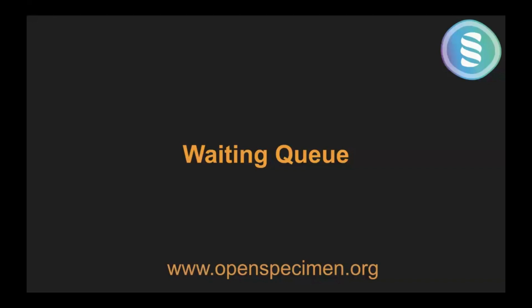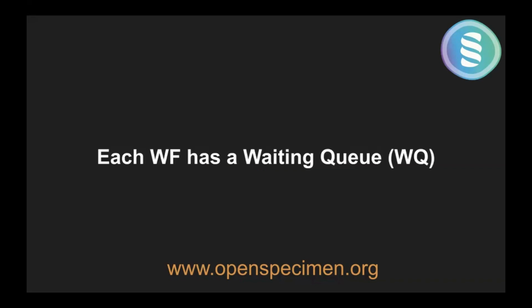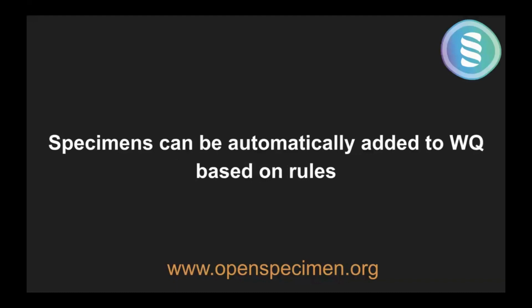Like I just said, if it is to be received and if it is whole blood, go to the blood processing waiting queue. If it is to be received and if it is tissue, put these specimens in the tissue specimen waiting queue. So things like that, so that can be automatically added to workflows.